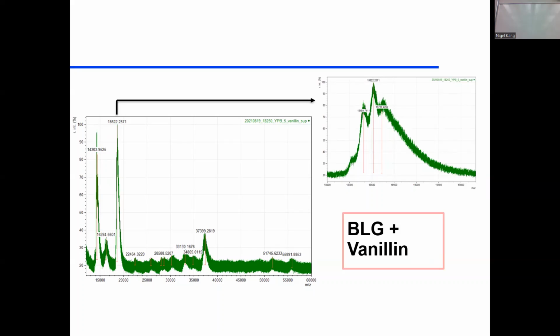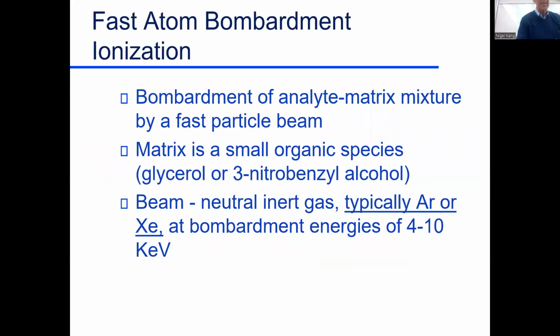There isn't much of it because vanillin doesn't react a great deal with proteins. But I've got a tiny, tiny peep here that shows I've actually got a chemical bonded onto my beta-lactoglobulin, my protein. So that's a technique we use a fair amount. But again, it isn't the best. The best is still coming.